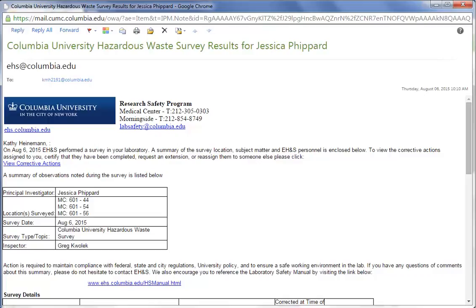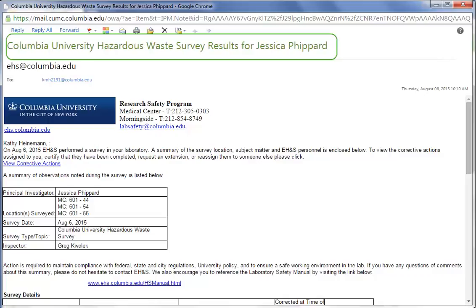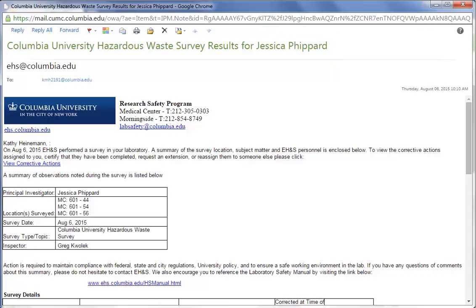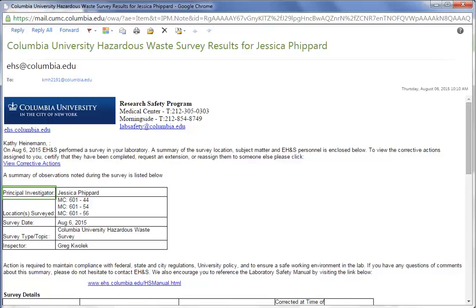You'll notice a few items in the email you receive. You'll see your name, and in the summary table, you'll see the PI, the lab rooms in the survey, the survey date, the topic covered, and who from EH&S was there.